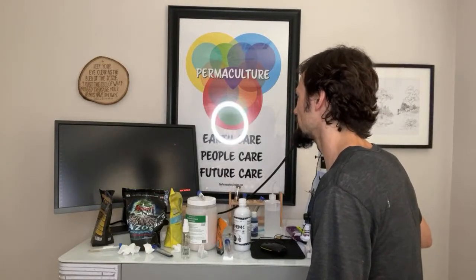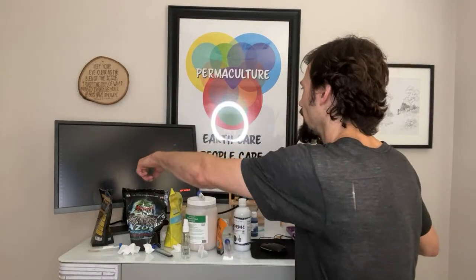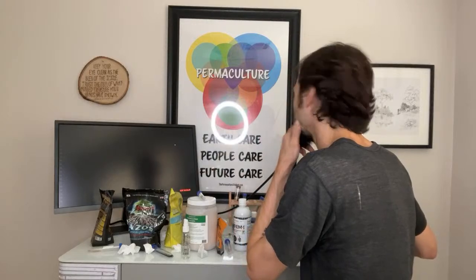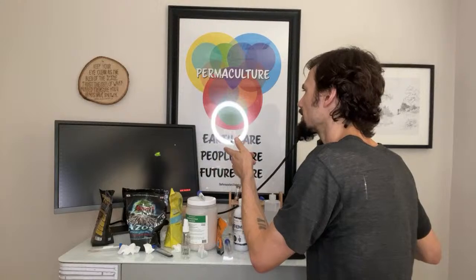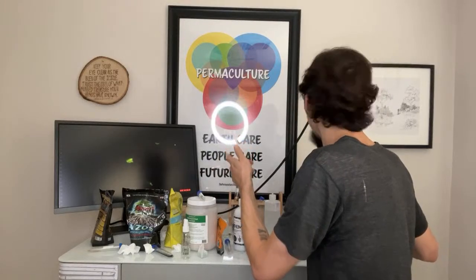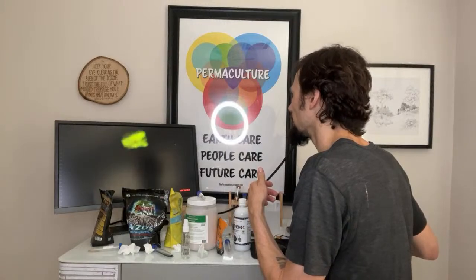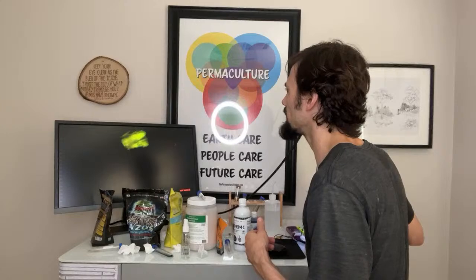This allows us to find things visually. See, that aura is from the actual damage to the glass. So as I move around with the lens, I think this is the actual one that we were looking at before, but let's dive in, let's see. No, this is pretty good. So this is another, 100% a piece of a root.